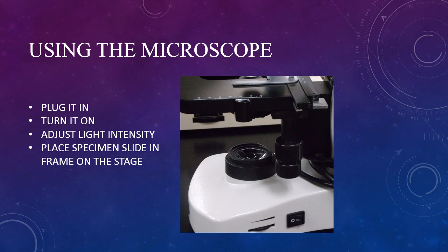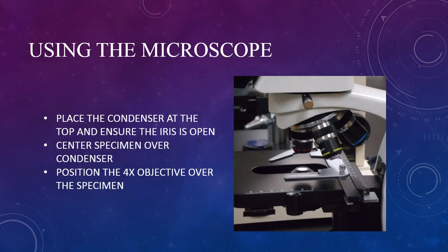Turn it on and adjust the light intensity to 50–60%. Too much light is hard on your eyes and can damage the specimen. Place the specimen in the frame on the stage. Bring the condenser to the top; it should be just underneath the slide.